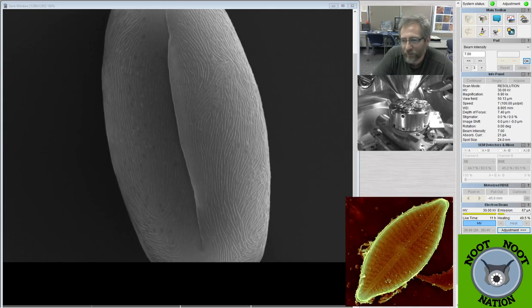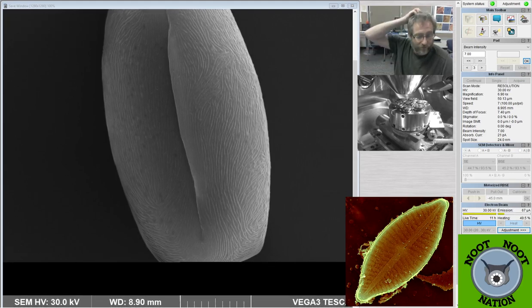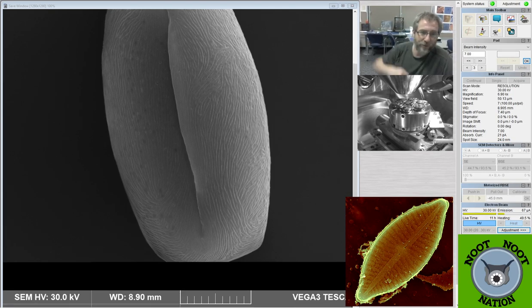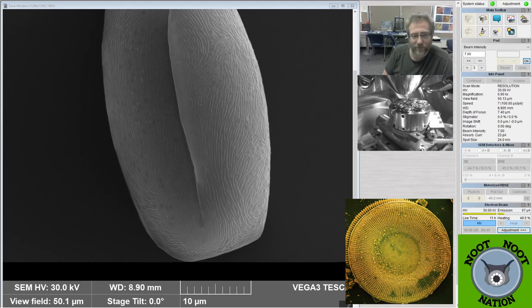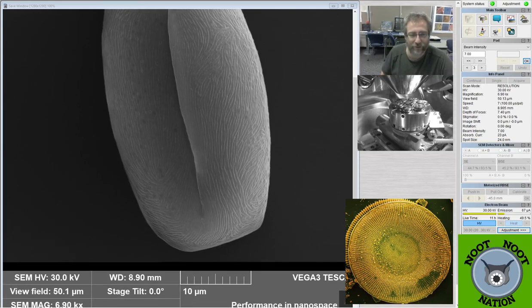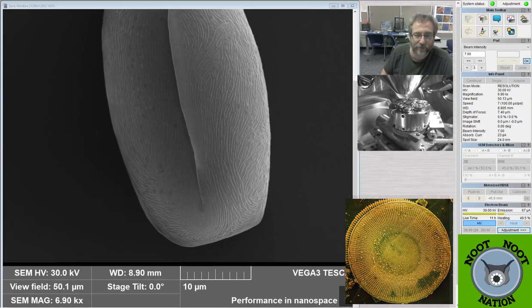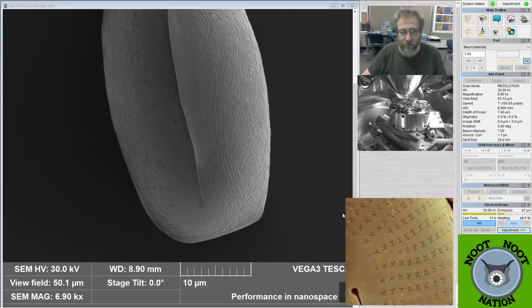You're always looking at SEM images for customer failure analysis. Yeah, there's a bunch of people in the College of Technology here who always want to use the SEM for looking at cracked things, broken things from microfractures, from failures, from engineering stuff. And then I think sometimes their students are looking at how to make microchips and things, which is kind of cool. But it's actually my lab, so I can look at whatever I want.